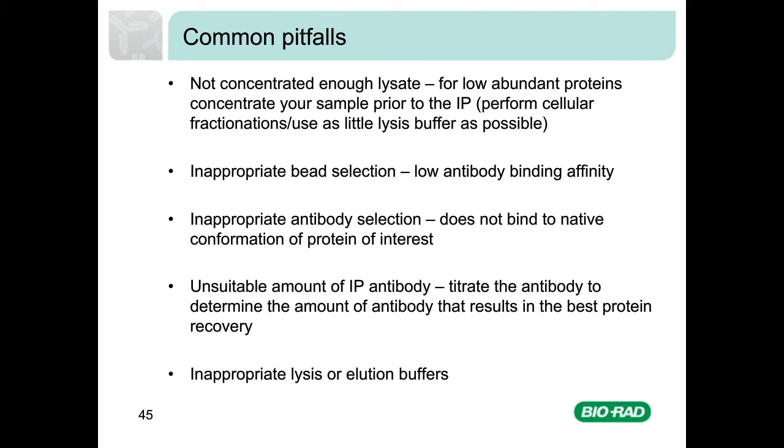Alternatively, you could check that the epitope the antibody binds to is in a region that is exposed when the protein is folded. To ensure optimal recovery of your target, always perform an antibody titration to ensure that you use the amount of antibody resulting in the most efficient pull down of your target protein.